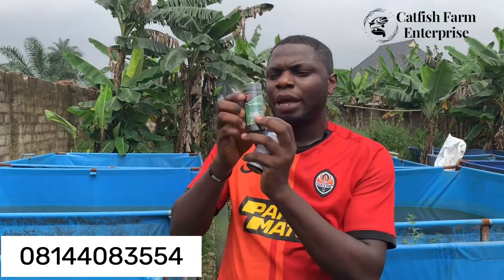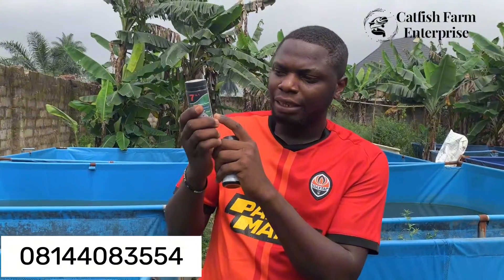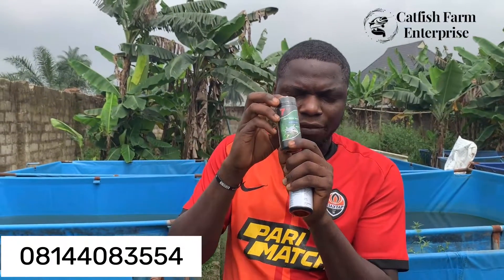This is a seven-in-one test kit. It can test the ammonia in the fish pond, the nitrate level, the nitrite, the iron level, the water hardness, total alkalinity, and also the pH. These are the seven parameters this simple test kit can help you discover in your fish pond, so there's no need to run a lab analysis for your water.